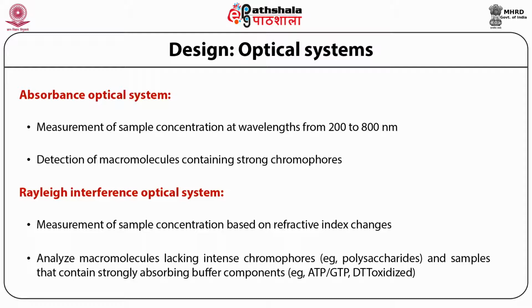A uniformly dispersed sample solution is placed in the cell and a sufficiently high angular velocity is applied to cause rapid sedimentation of solute towards the bottom of the cell. As a result, there is a depletion of solute near the meniscus, causing the characteristic spectrum-like figure you can see here, and it reaches the plateau. A sharp boundary occurs between the depleted region and the sedimenting solute, as you can see in the plateau formation once you plot the radius versus the absorbance.